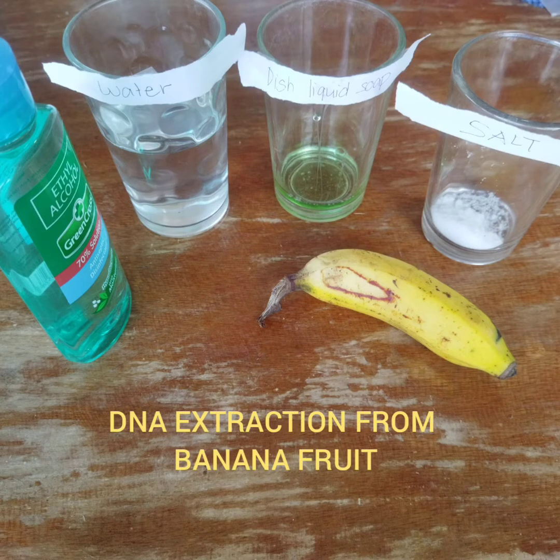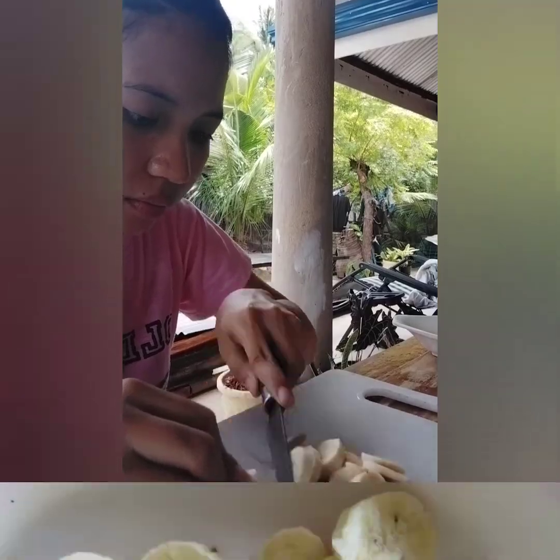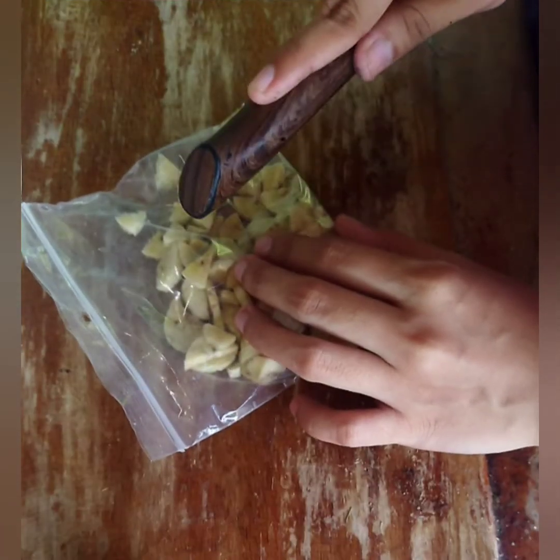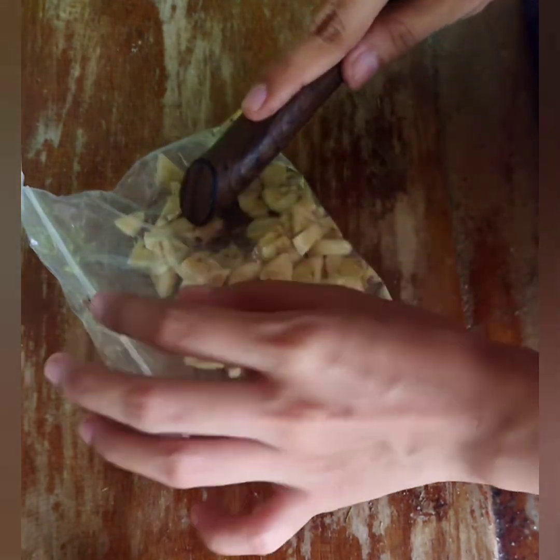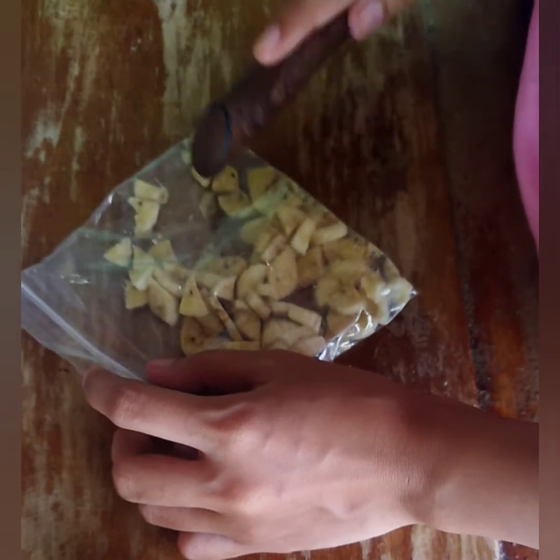First, prepare your materials. Then cut the banana into tiny pieces to expose more of the cells. Squeeze the banana and turn it into the bag, then seal the zip-lock bag.